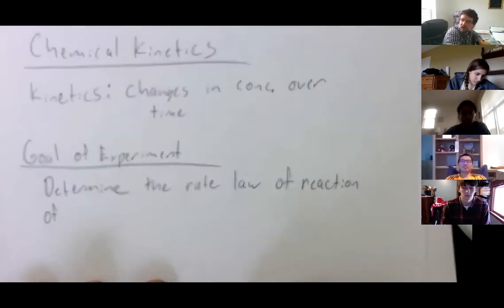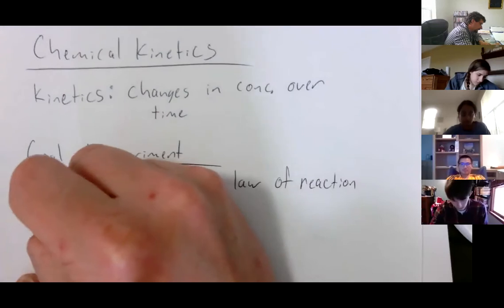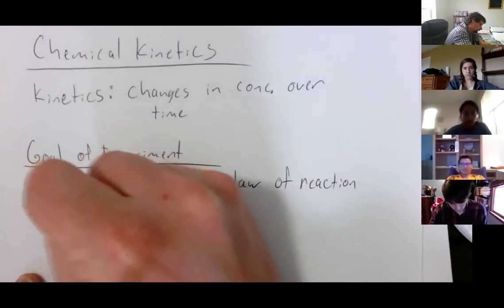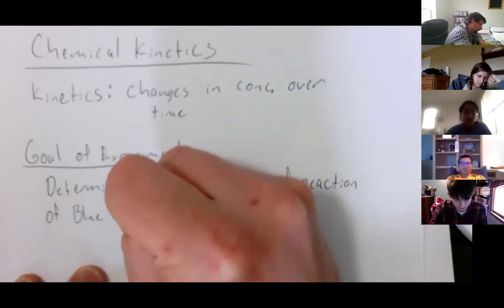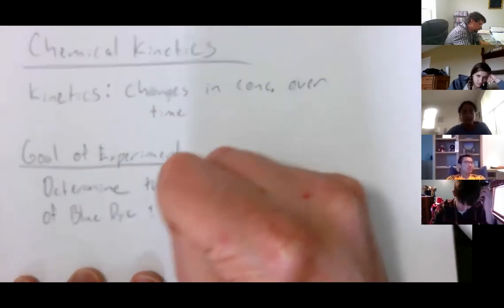What are the two species that were reacting together? Blue dye. Yep, the blue dye. And sodium hypochlorite. Yep.